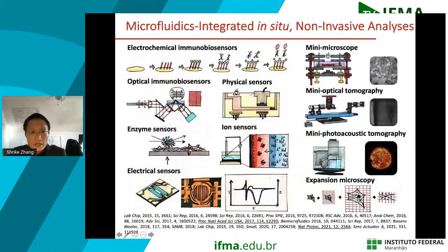All right, so from there, I'm going to end with one slide showing that we have also been doing some sensing work to allow in situ real-time monitoring of these microtissues in the microfluidic devices.